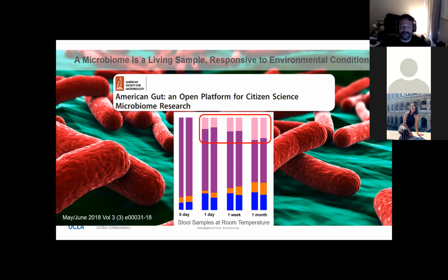And this ends up becoming a huge issue. So these samples were mailed in without any refrigeration or preservative. And what happens is a stool sample inside the patient is at about 37 degrees centigrade, and it is in a low oxygen environment. Once that sample leaves the patient and goes out into the atmosphere, it's now dropping to 20-something degrees probably, or whatever the ambient room temperature happens to be, and it's now exposed to oxygen.